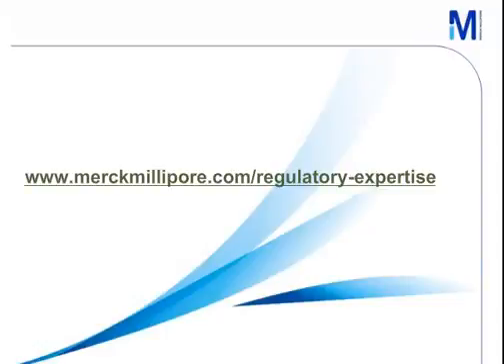But there is a sentence in the standard that preferably these strains will be selected from food and water matrices, where it is possible. Okay, thank you, Barbara. Next question.